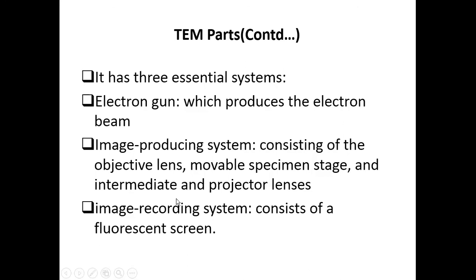And then intermediate and projector lenses. Of course, these are all the imaging system. There will also be primary and secondary apertures, which I will explain in detail.